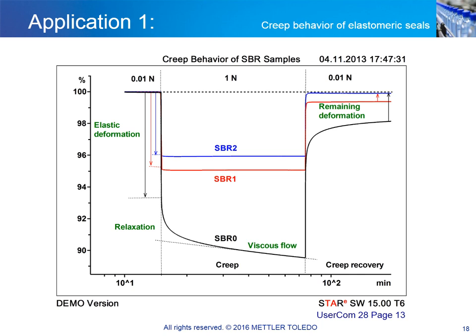The samples undergo creep, which lessens with increasing vulcanization due to the restraint imposed by the crosslinks. The material deformation is desirable when the elastomers are used for sealing purposes, but when the stress is removed from the material, they should ideally return to their initial form.